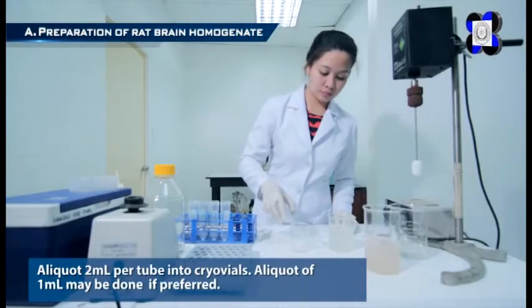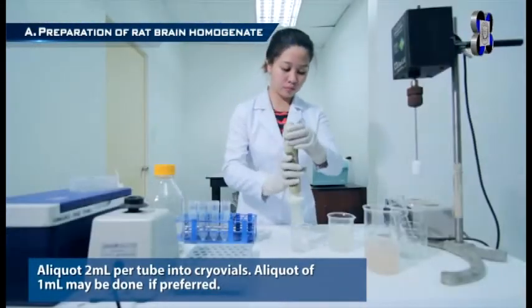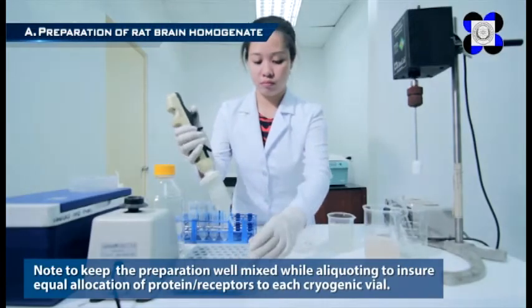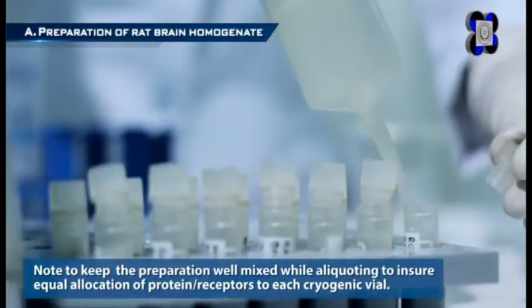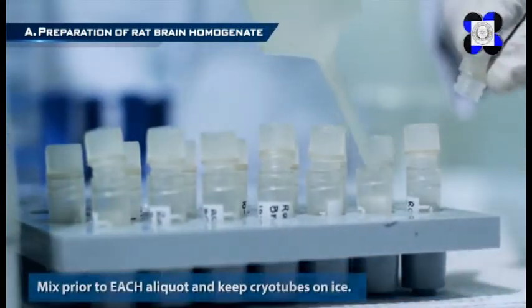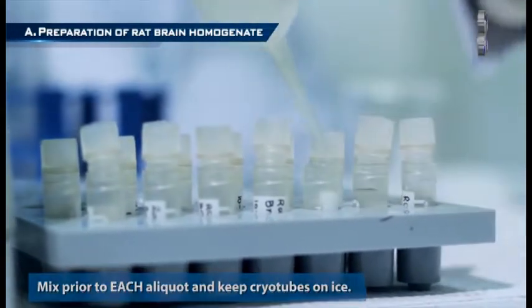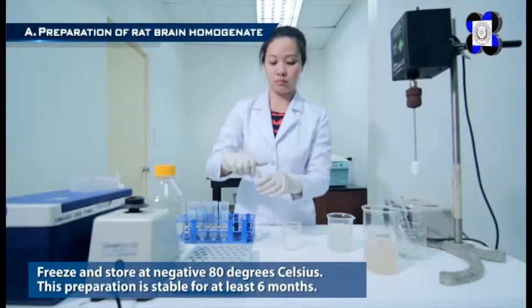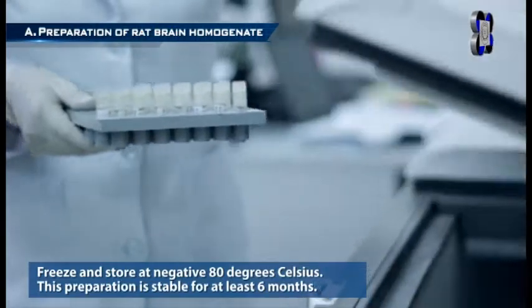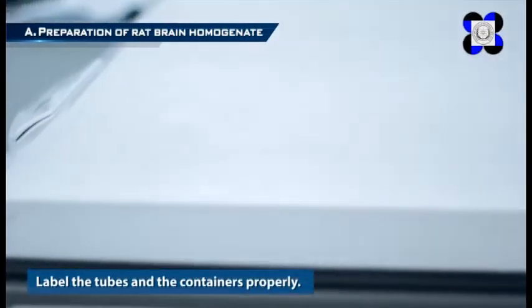Aliquot 2 milliliters per tube into cryovials; aliquots of 1 milliliter may be done if preferred. Keep the preparation well mixed while aliquoting to ensure equal allocation of protein receptors to each cryogenic vial. Mix prior to each aliquot and keep cryotubes on ice. Freeze and store at negative 80 degrees Celsius. This preparation is stable for at least 6 months. Label the tubes and containers properly.